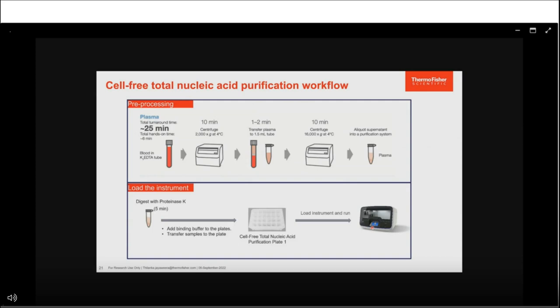To separate plasma from whole blood, a two-step centrifugation process is required: first at 2,000g for 10 minutes at 4°C, then the plasma is separated from the whole blood and undergoes another centrifugation at either 16,000g for 10 minutes or 6,000g for 30 minutes to remove cell debris. Once plasma is separated, it's easy to set up the extraction run on the GeneXus purification system by adding proteinase K solution to the sample, mixing it, adding the binding buffer to the plate, transferring the sample to the same plate, and loading onto the instrument.